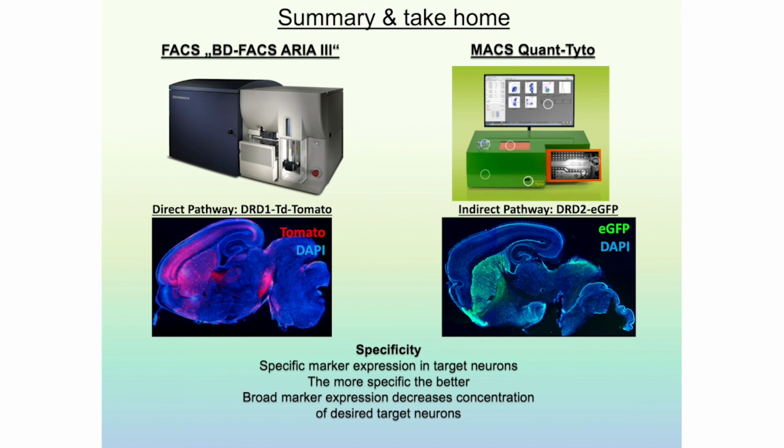So again, I want to point out marker specificity. I said this before, it depends on how specific your marker expression is, and this determines actually the purity of your cultures.